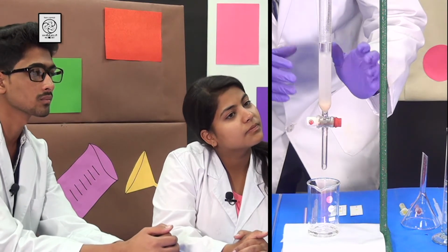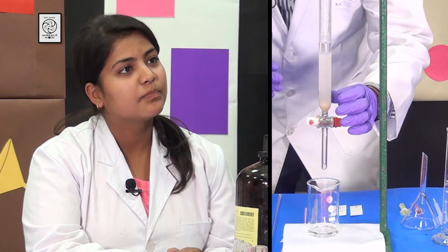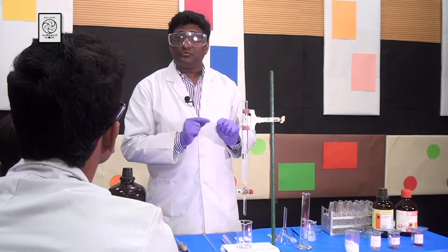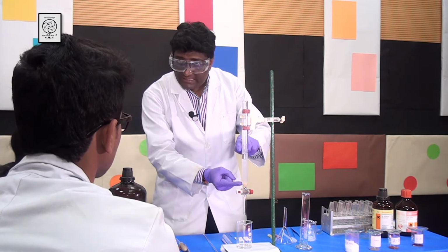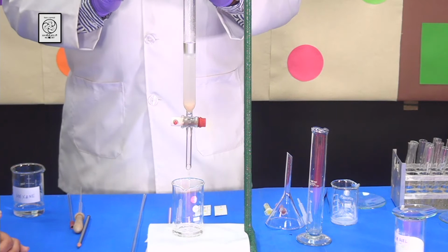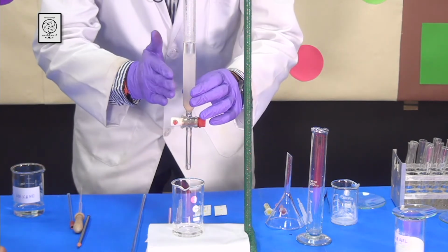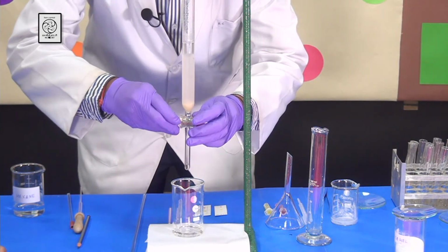Now students, you can see that the silica gel is settled nicely and there is some hexanes on the top of the silica gel. Now I am going to tap the column. Sir, why do we need to tap the column? Oh, we need to tap the column so that we can get rid of the air bubbles and the silica gel will settle nicely and the purification can happen properly. Okay, sir.